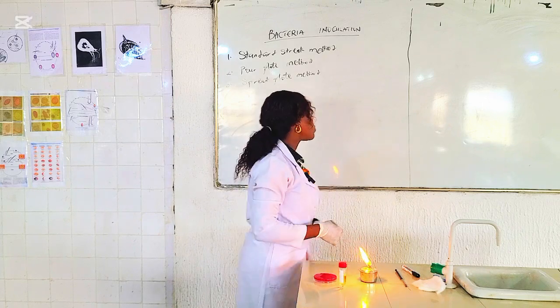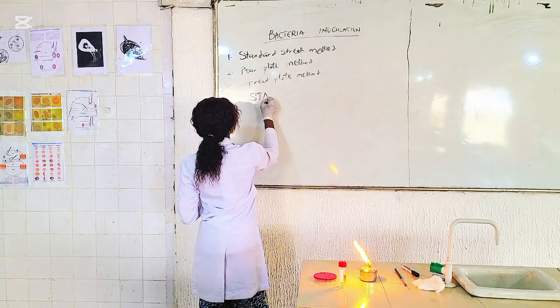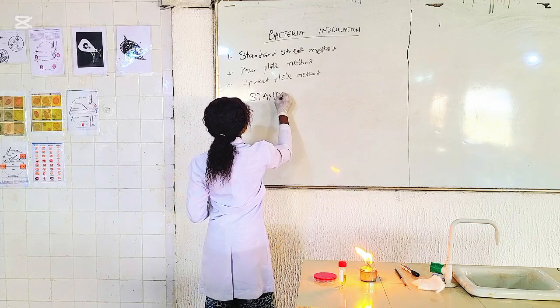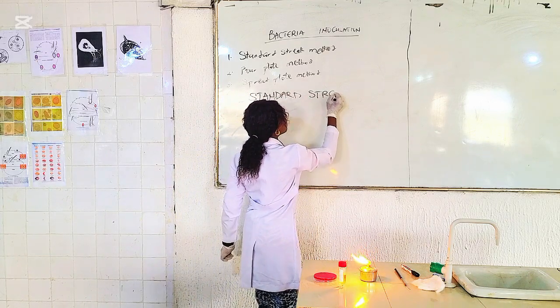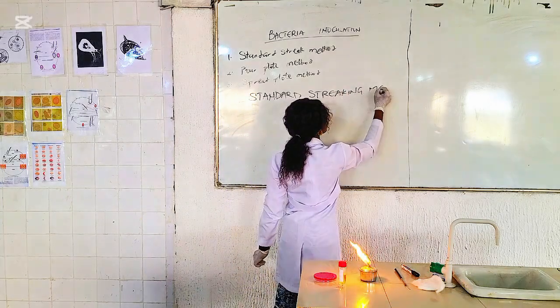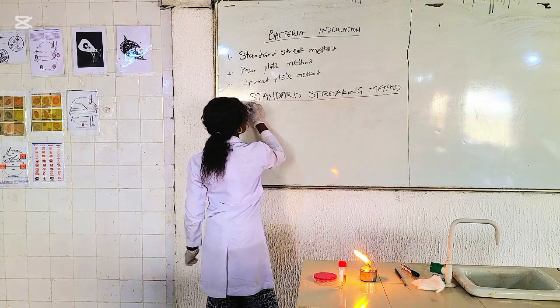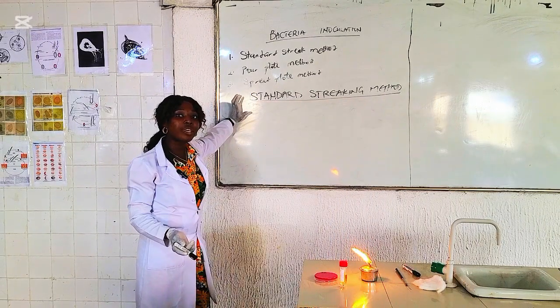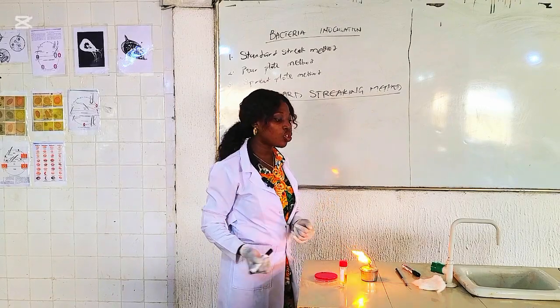inoculum. So for today's learning purpose, we're focusing on the standard streaking method. Why standard streaking method? Now I'll tell you the advantages, or why you should do standard streak.